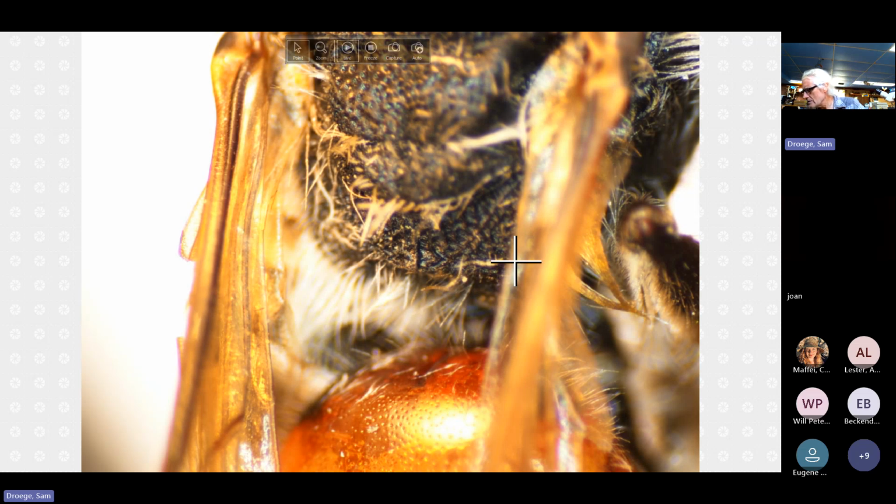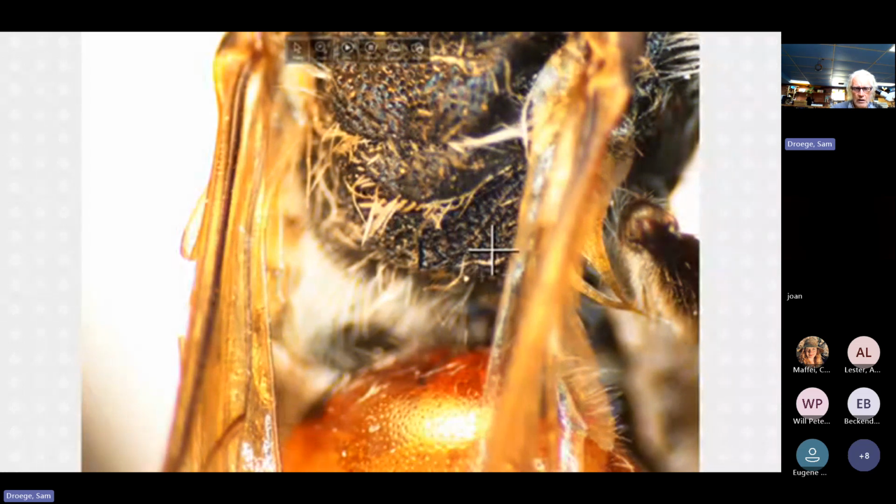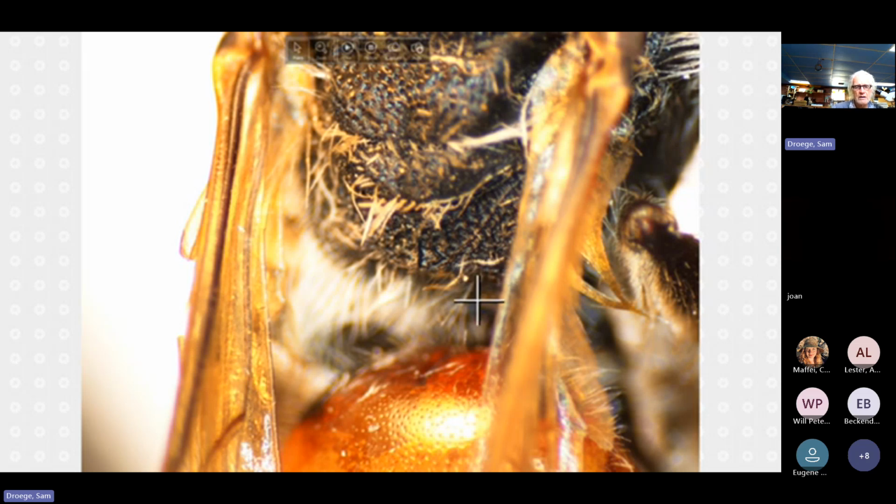In this particular case, how much time do we have left? 140. Okay. So there's not a whole lot of difference. I'm just pointing that out, I'm not sure that's a key character here, but sometimes you'll see this line very crisp. This area tends to be relatively large open cells defined by raised lines, and this area can be very tightly knotted up with a jumble of hills and valleys forming a rough surface. Other times they look about the same.